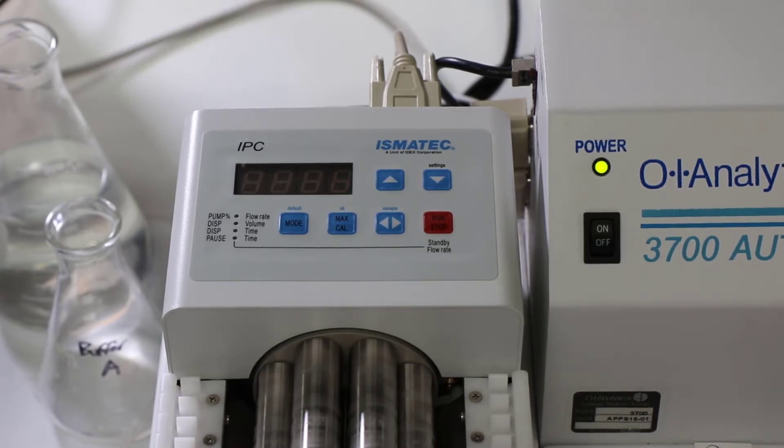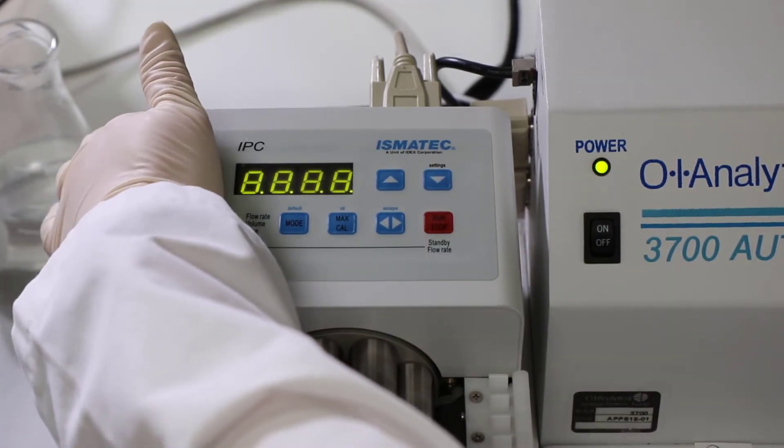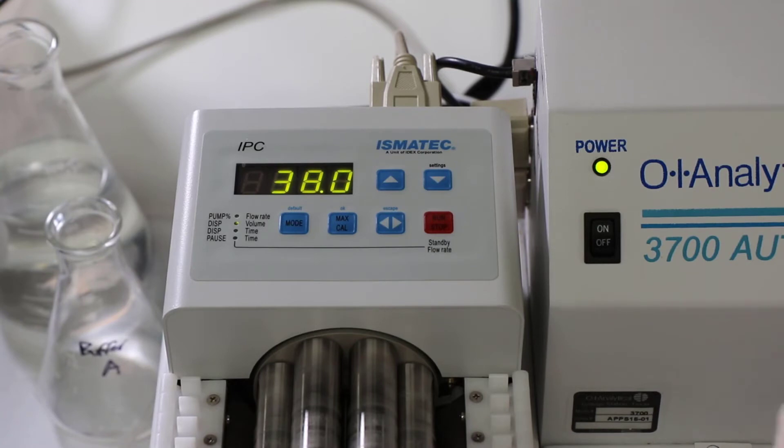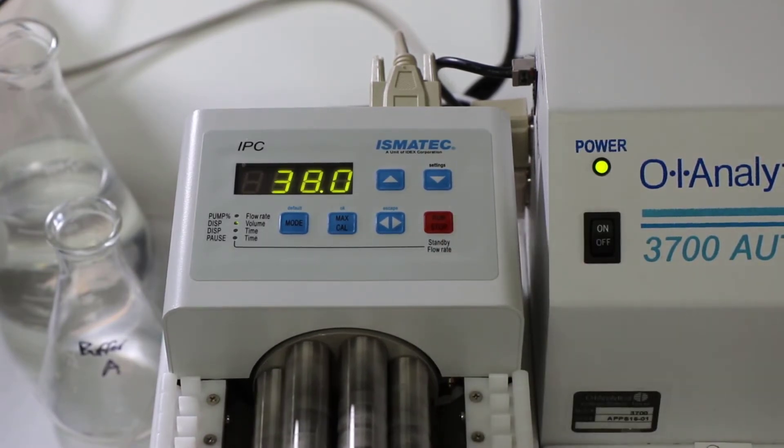So once the 10 seconds is up, you're going to flip the power switch back on, and the speed that you just set it to should show, and then you hit the Run Stop and it'll start running.